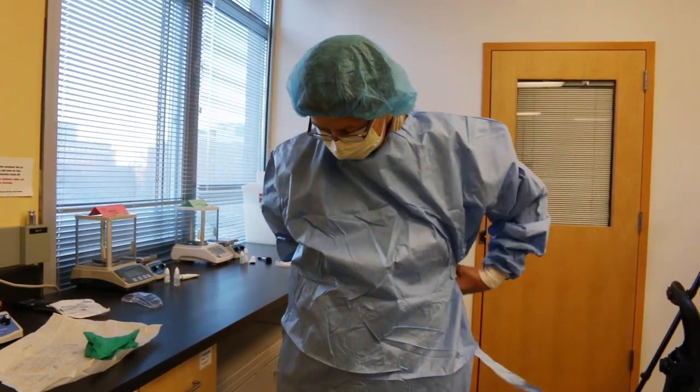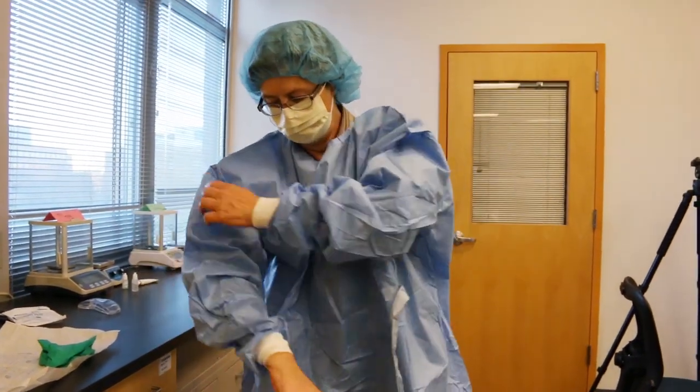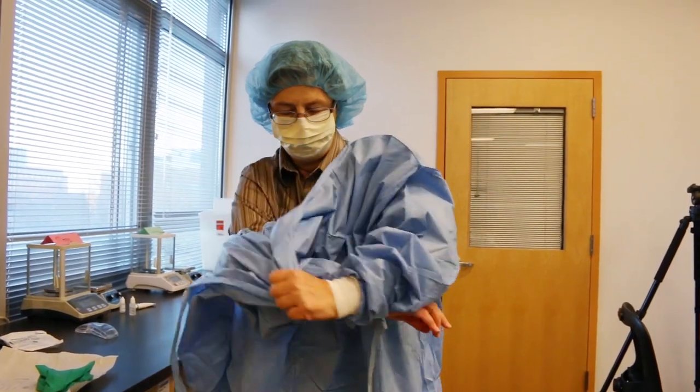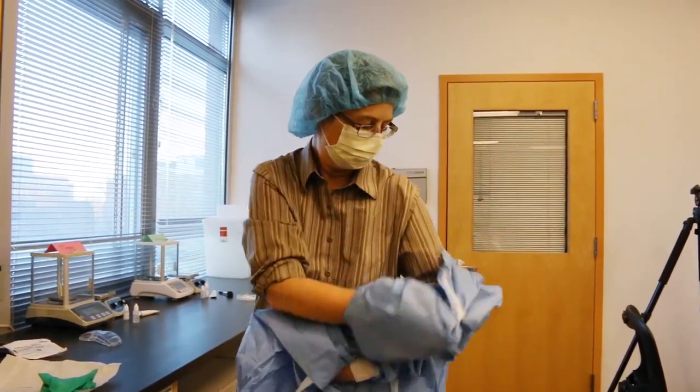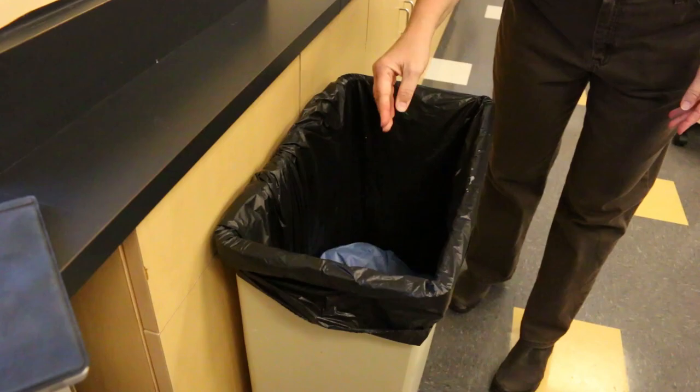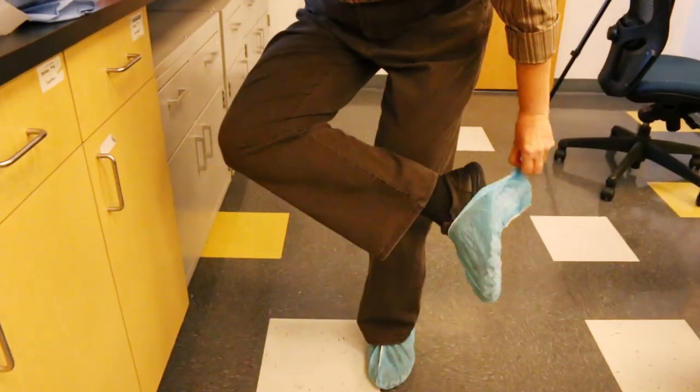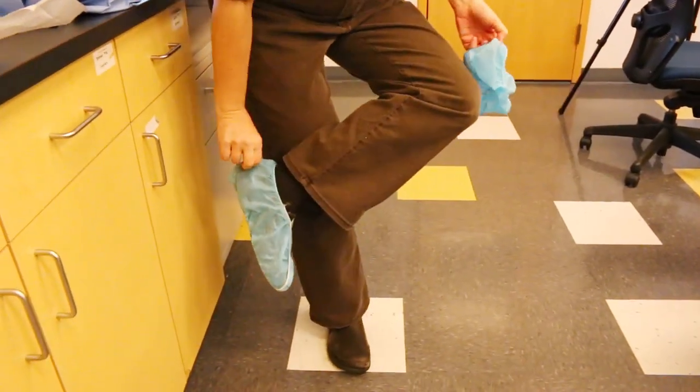Untie the gown and remove it by pulling at the shoulders, turning the gown inside out, and place it in a waste container. Step 27E, remove the face mask, hair cover, and shoe covers, and discard them in the waste container. That is the end of skill 7.